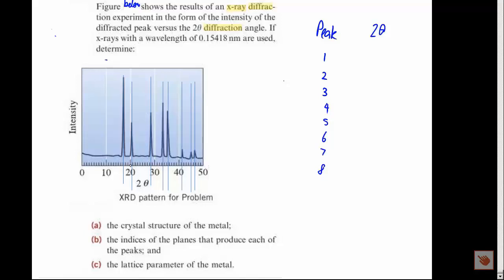The first peak occurs at 17 degrees. The second peak, 20.5. The third peak occurs at 28.5 degrees. The fourth looks like 33.5.